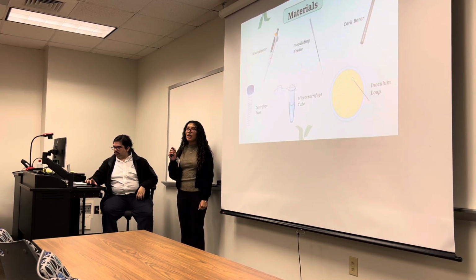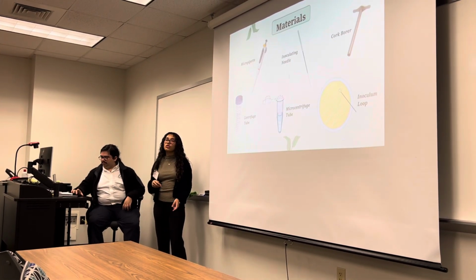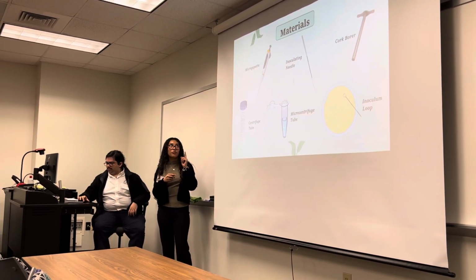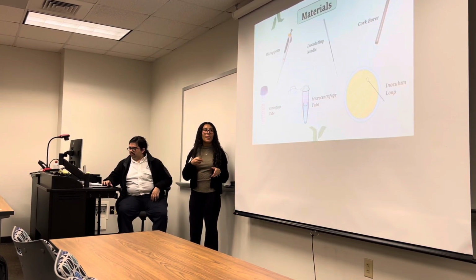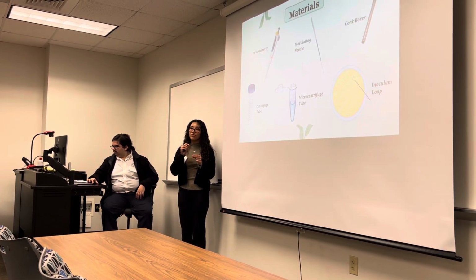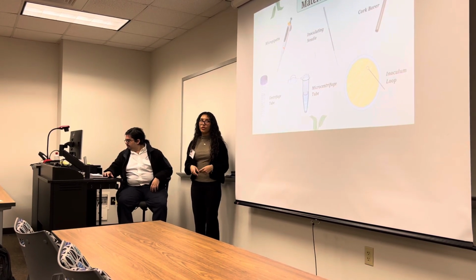We put 900 microliters of deionized water in 3 of the microcentrifuge tubes, and then purely 100 microliters of this slurry of just the soil and the saline in the first microcentrifuge tube. Then we would use the micropipette to take from the first microcentrifuge tube to the second to create dilution, and into the 4th one, diluting it further.